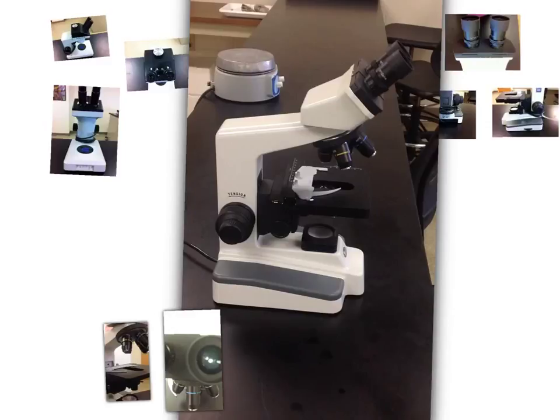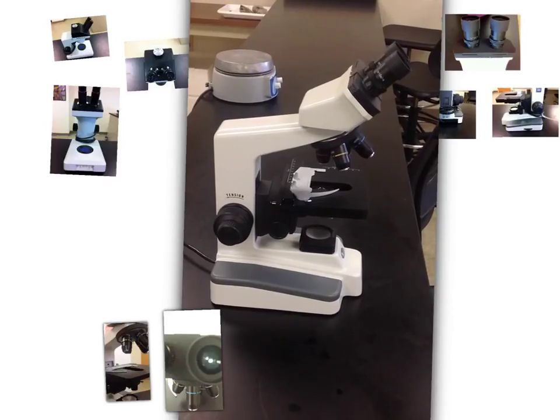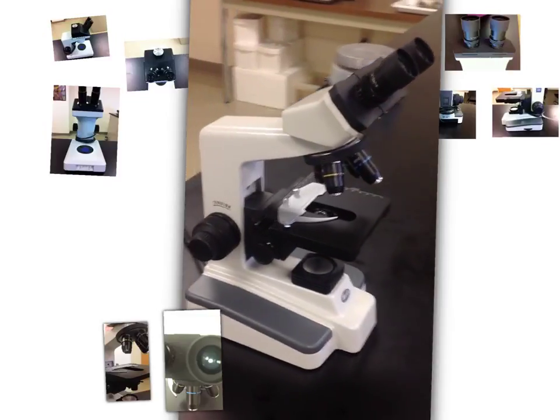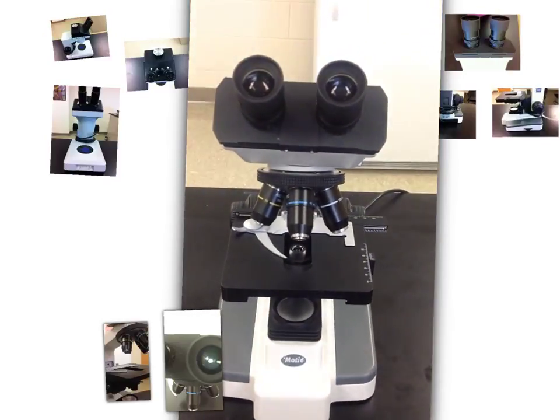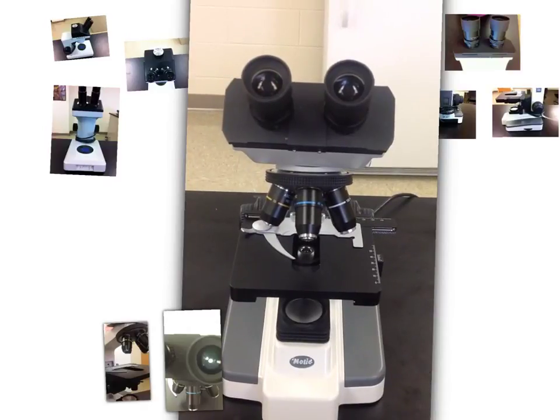So here we have our microscope. Let's take a look here. So here it is looking straight on.